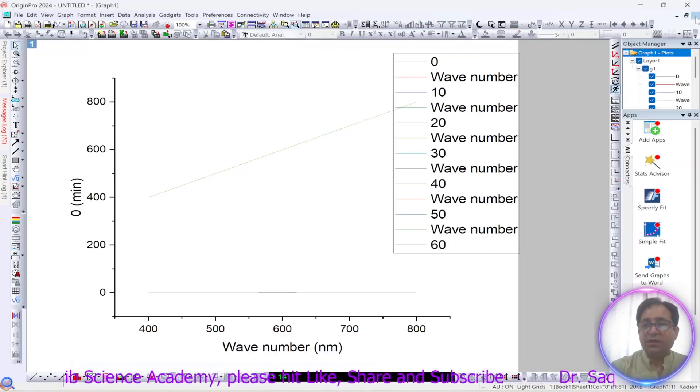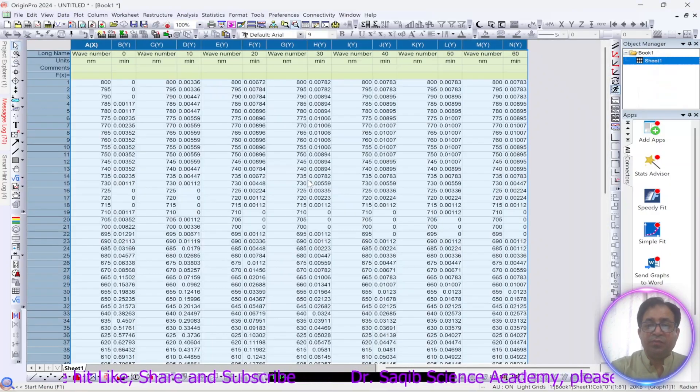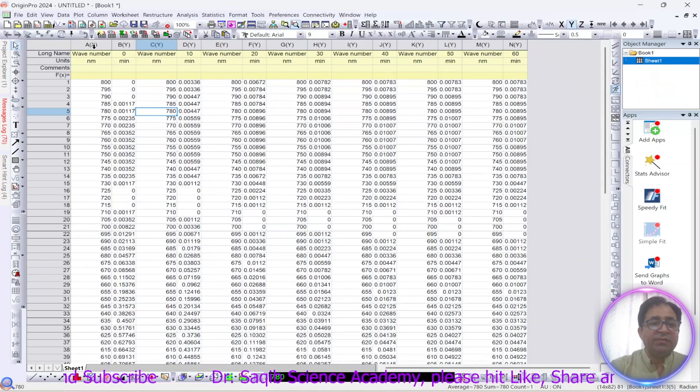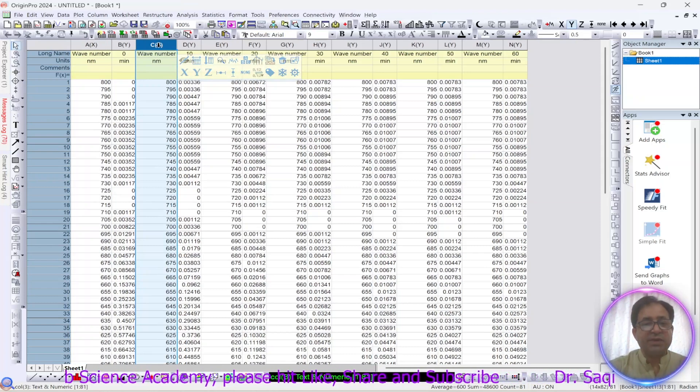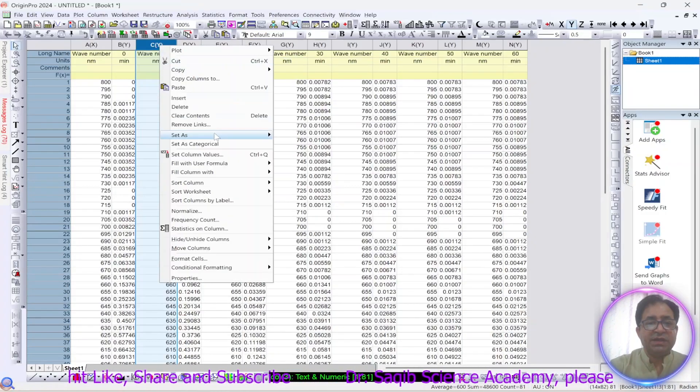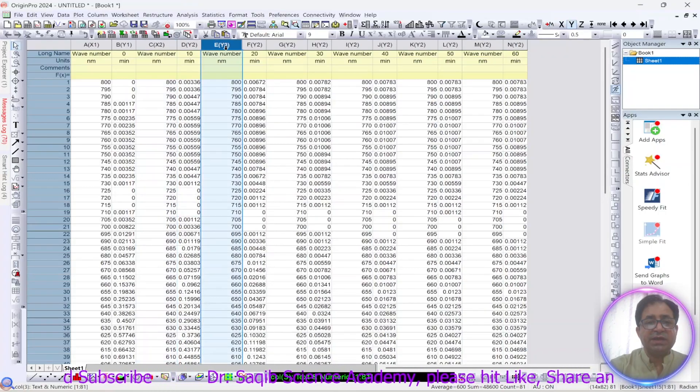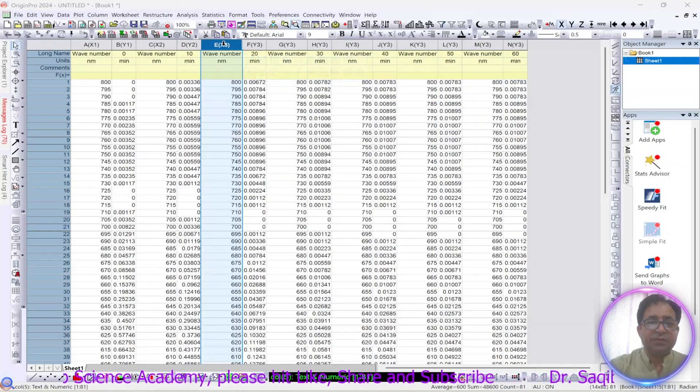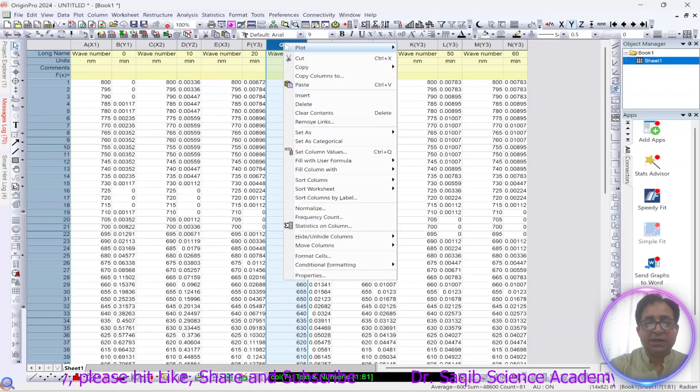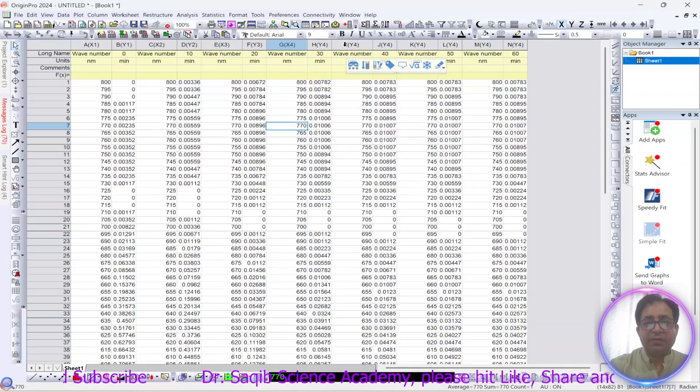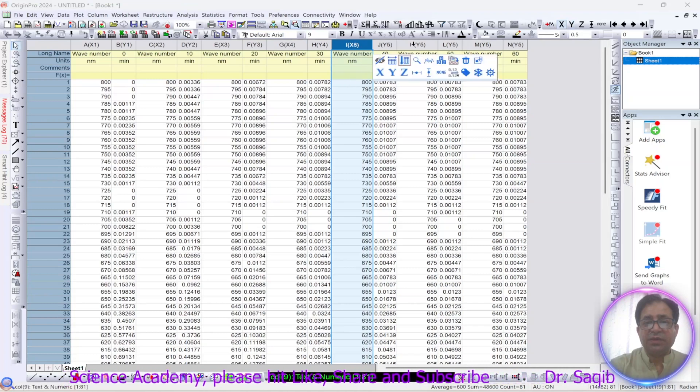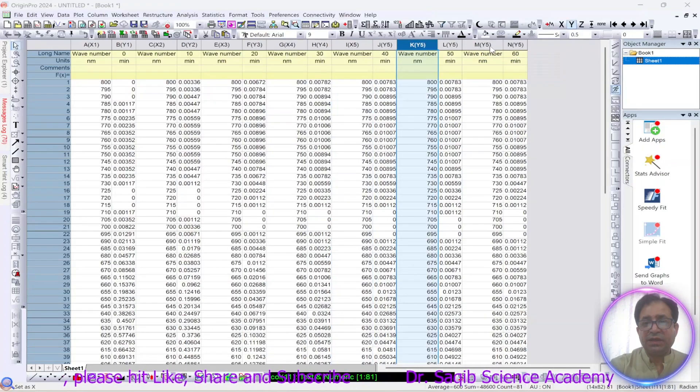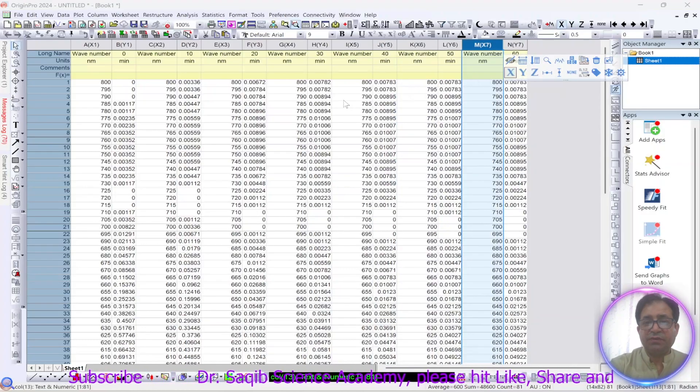Okay, one thing which we forgot most of the time is that whenever the wave number, as we know it is always on x axis. You can use the same wave number or you can just directly set it as x. In older version of Origin you have to select this one, right click and then set it as x, but in newer version you can just put the cursor over here and it will show you what you want to do. So just select x axis if you are using the latest version.